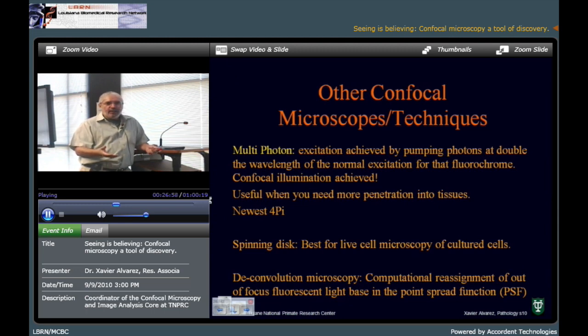And the other is, I think that confocal has better resolution than deconvolution. Whenever you find another person that uses deconvolution, they say it's the best thing. Deconvolution had, at the moment, a limited number of fluorochromes that could be used, because it's very difficult to deconvolve multiple signals at the same time. That would be an advantage of having a true confocal microscope.